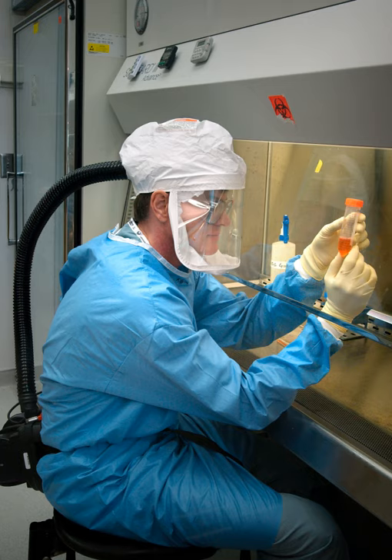Topic: Purposes. The primary purpose of a BSC is to serve as a means to protect the laboratory worker and the surrounding environment from pathogens. All exhaust air is HEPA filtered as it exits the biosafety cabinet, removing harmful bacteria and viruses.